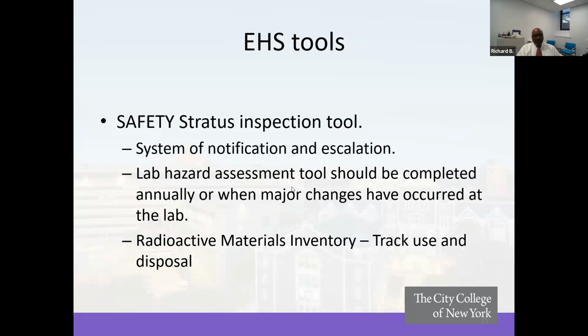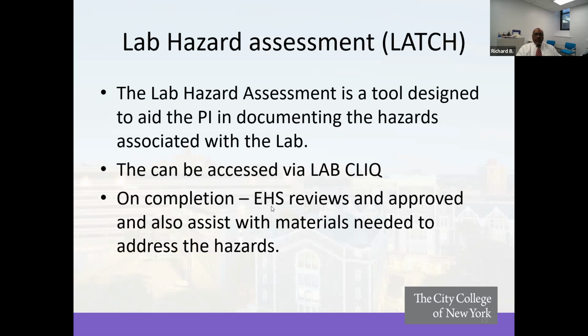Let me proceed really quick and talk about a little reminder about the Safety Stratus inspection tool. Like I said earlier, it's a system of notification and lab hazard assessment and escalation, and a tool that allows you to do your lab hazardous assessments as necessary. It is designed as a tool to aid the PI. It is accessed via the lab click module.